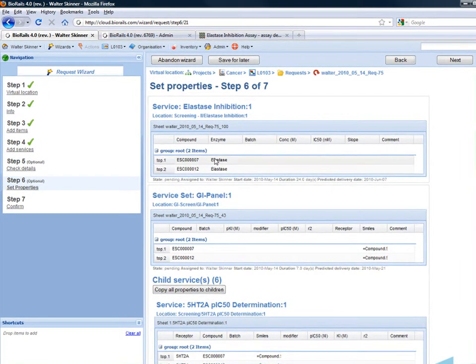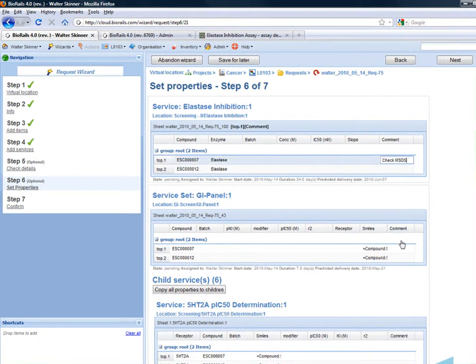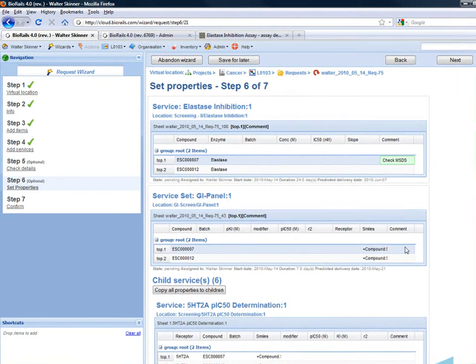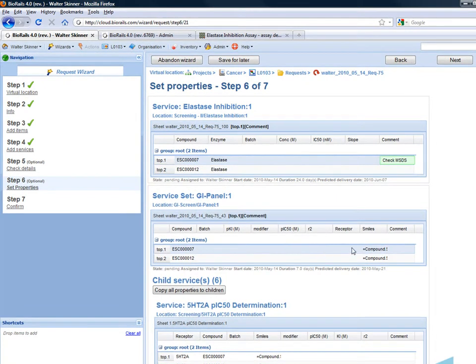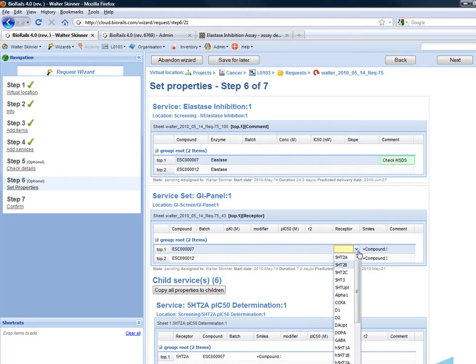I can also supply extra information for the assay such as any warnings about safety issues. I may also be able to specify a particular receptor that should be used for the assay.